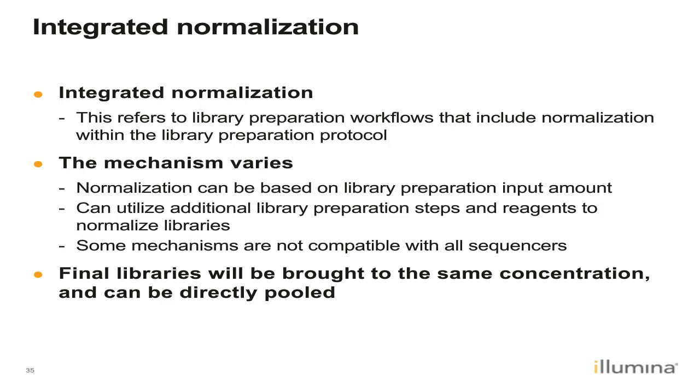Integrated normalization refers to library preparation workflows that normalize the libraries for us. Different library prep methods use different strategies. Some normalize the samples based on meeting input thresholds. Other preparation kits use additional reagents and protocol steps to normalize the libraries. Not all library preparation methods include integrated normalization, and some integrated normalization methods are not compatible with all sequencers.